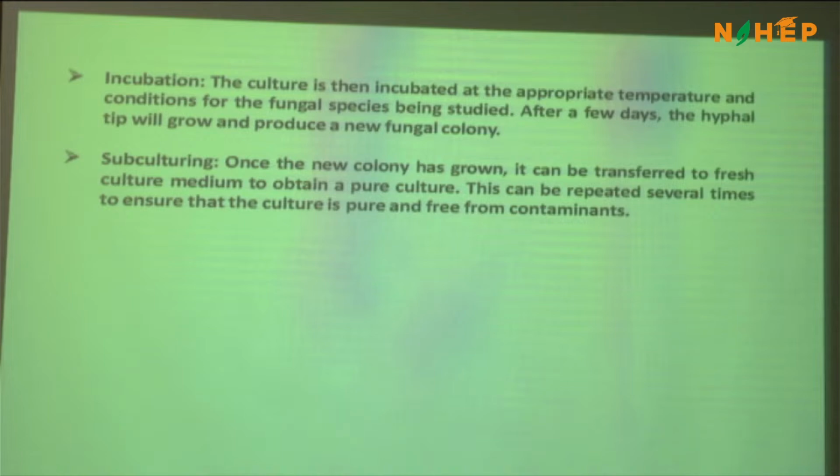I think the video was a very nice video. So they really form a kind of thick mycelial mass, and they are very difficult to segregate, and they resist most of the attack, what do you call, lysis attack. So better you grow in agitation mode.